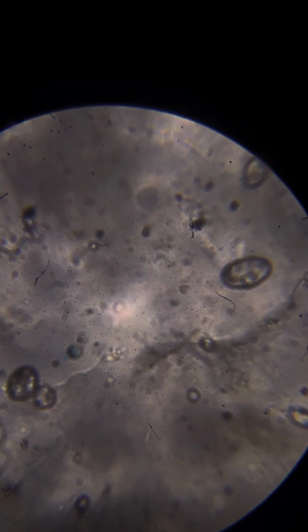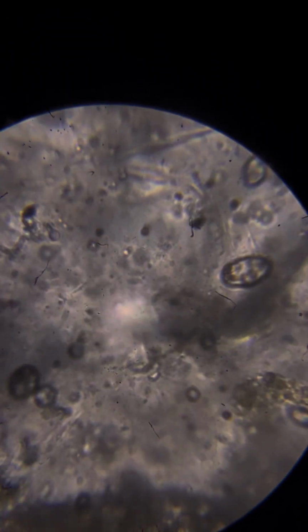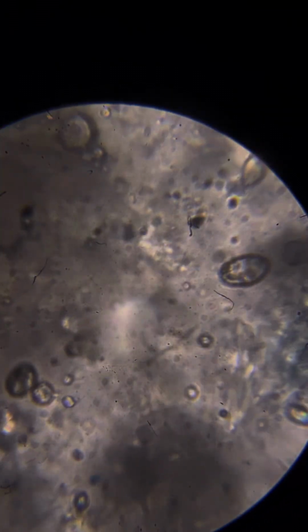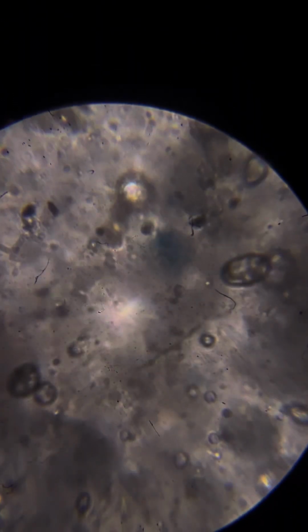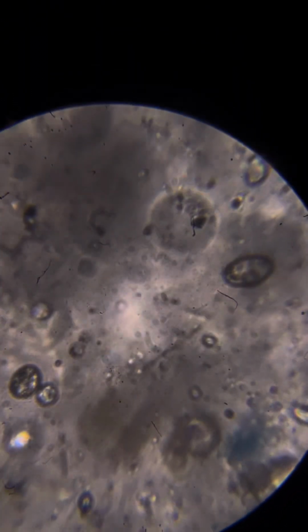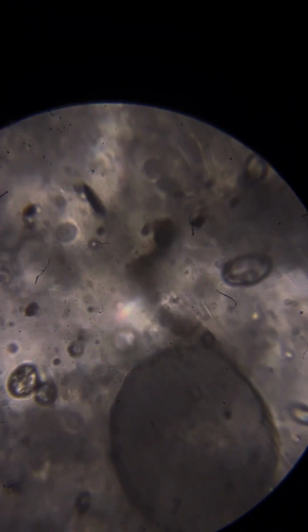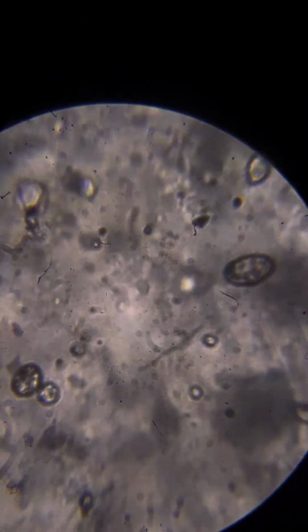Actually, maybe because I re-screwed some of the screws in the microscope, we're able to focus pretty well with this. I think this is 600 or 900 magnification, I don't remember right now. I think 900. It looks fine, and as you see, you can see neos on every level, in every magnification. The smallest sizes are probably in the nanoscopic scale, but at every level of zoom that we can use with this microscope, we see a tremendous amount of neos, which is great.